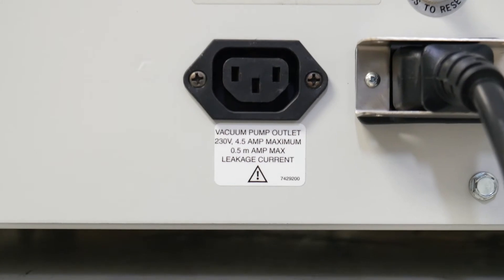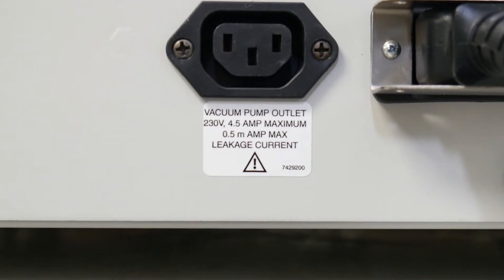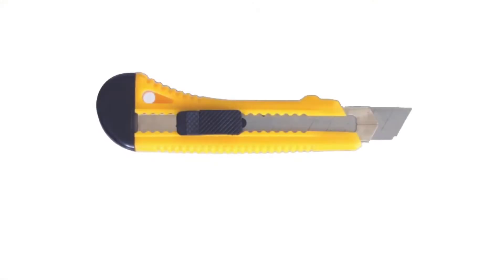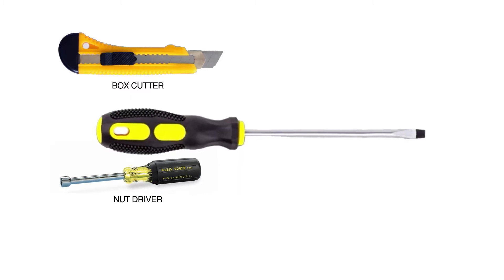Before installation, be sure the voltage of your scroll vacuum pump is compatible with your FreeZone or CentriVap system. The tools required for installation are a box cutter and a nut driver or flathead screwdriver.